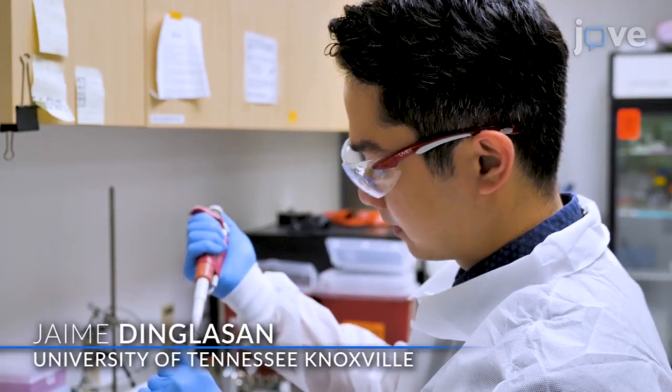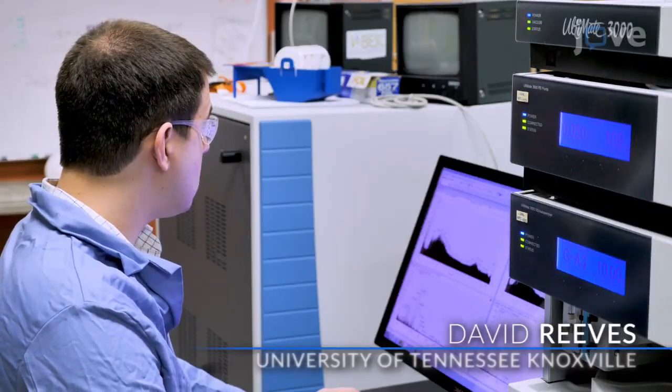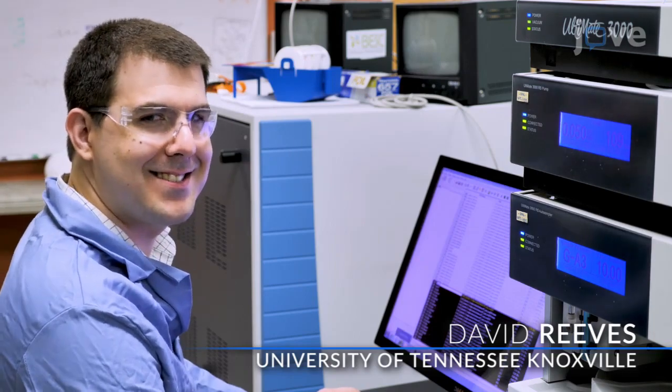Demonstrating the procedures will be Jaime Lorenzo Dinglasan and David Reeves, graduate researchers from the Biosciences division.